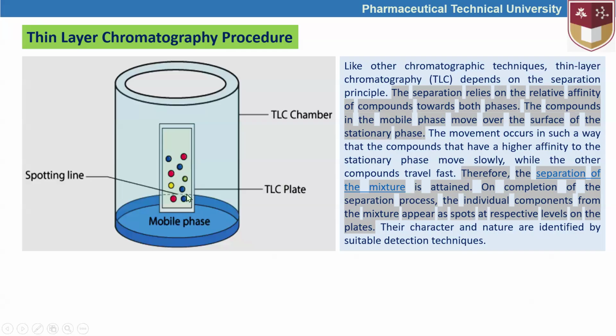Again, here the separation can be based on the affinity between the stationary phase and the mobile phase, including the extract, for example, the mixture of compounds.